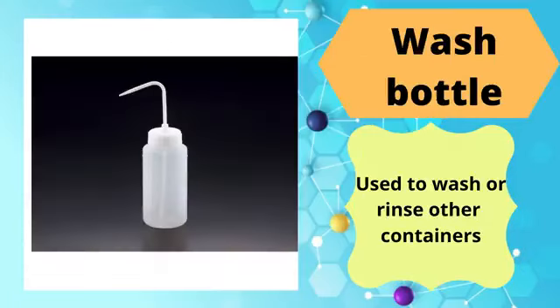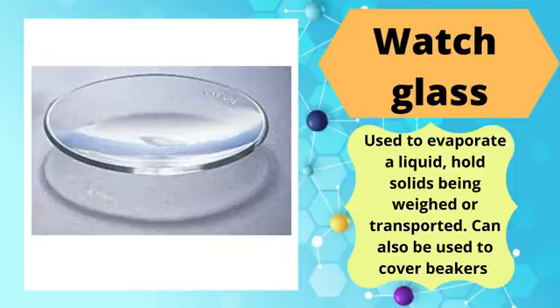Wash bottle, used to wash or rinse other containers. Watch glass, used to evaporate a liquid, hold solids being weighed or transported. Can also be used to cover beakers.